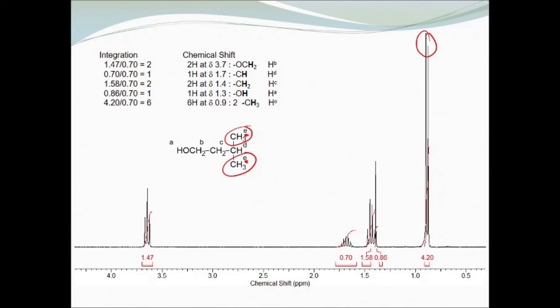That tells you whether you're dealing with a CH2 or a CH1 or a CH3 or possibly two CH3s. But it gives you that integration so you can determine that. Then use chemical shift. Identify your OH since you're dealing with an alcohol. Then look at chemical shift to identify your alkoxy, the OCH, and whether it's an OCH or an OCH2. And then use the splitting to determine what is bonded to what to get a final structure. And don't forget to label the hydrogens.